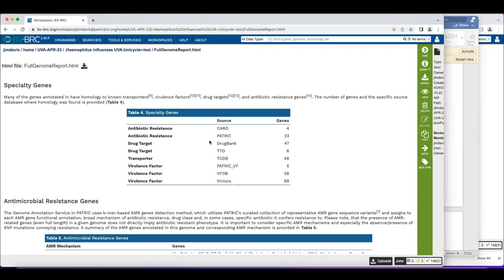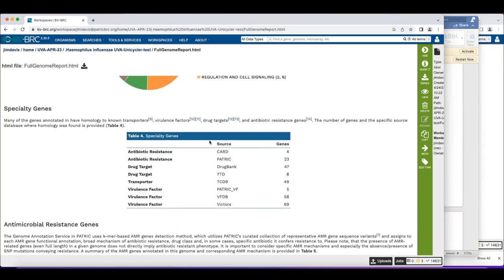A lot of people think that specialty gene matches are an imputation of resistance, and that's not true. CARD has gyrase; NCBI has gyrase — when we do the protein-based match you will get it, but that does not tell you your genome is resistant. The difference between CARD and the PATRIC AMR gene list is primarily curation by different groups. Some annotations may be over-projections, so you need to look more carefully at those.